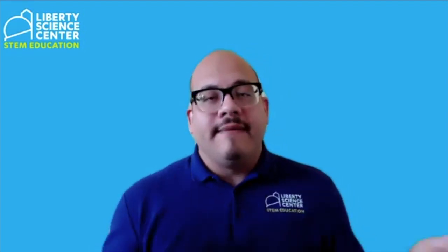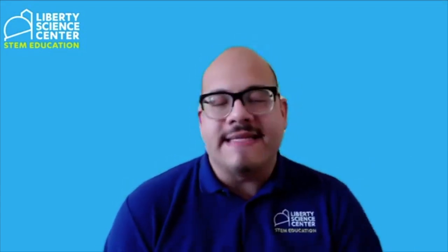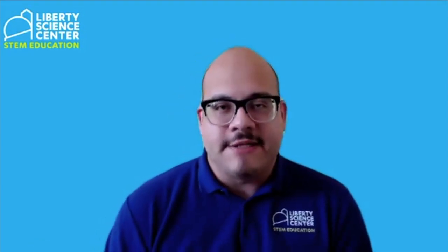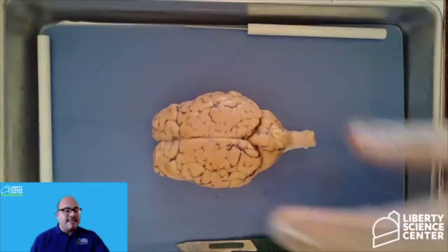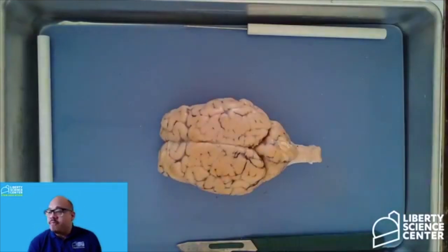On top of that, I just want to give a nice little shout out to the animal that was able to give us this opportunity to have this dissection available for you all. All right, so let's start with our dissection. Okay, so here we go. We have the brain specimen right here. This is a sheep's brain.